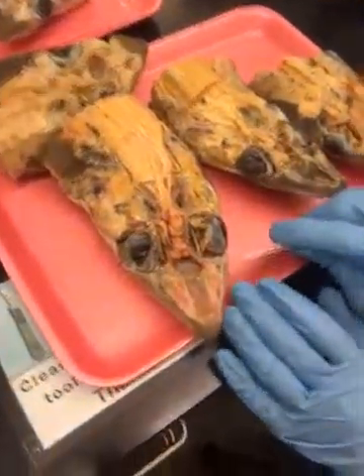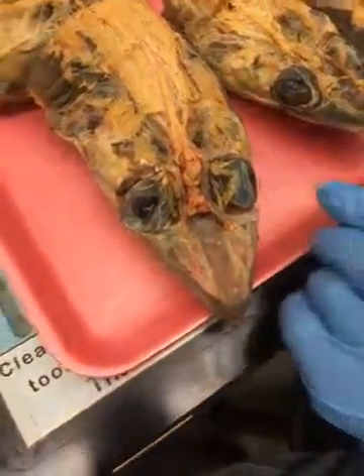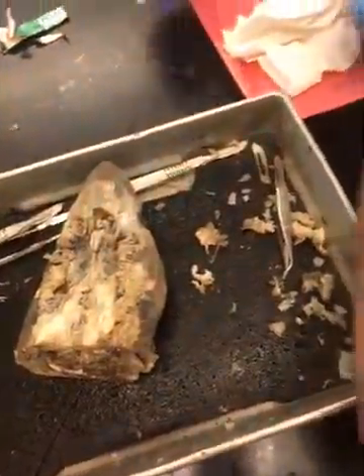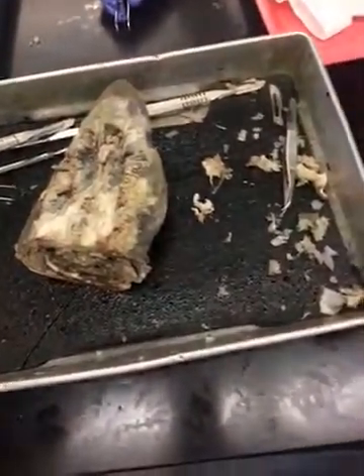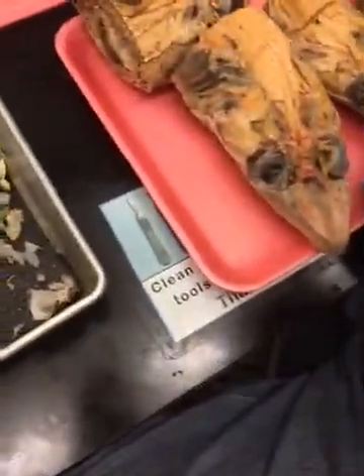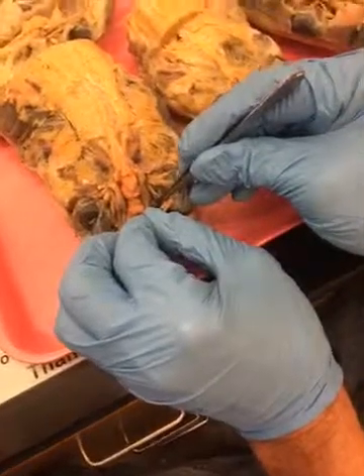The olfactory nerves are many little nerves that run from the bulb to the nasal capsule, just like I described in mammals. The optic nerve, let me find one here. You don't need to now, but you need to snip around one of your eyes so you can get into it. So I will do it on one of these. Okay, it's got to be here. That is the optic nerve right there.